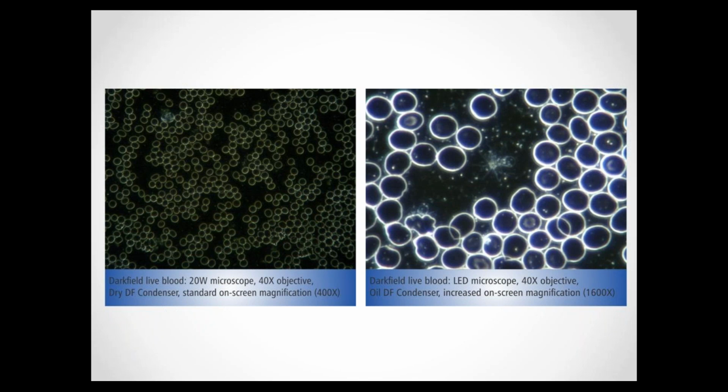And secondly, if the microscope system isn't suitable for live blood analysis, then they obviously wouldn't be able to see all those anomalies that they might be aware of, but their system wouldn't allow them to actually see. Okay, I see. So in the invitation to this webinar, we mentioned that not all microscopes are created equally. As we mentioned earlier, some microscope systems are very cheap, whilst the microscopes used for live blood analysis tend to be more costly. So what are the reasons for the higher price tag on the live blood analysis microscopes?